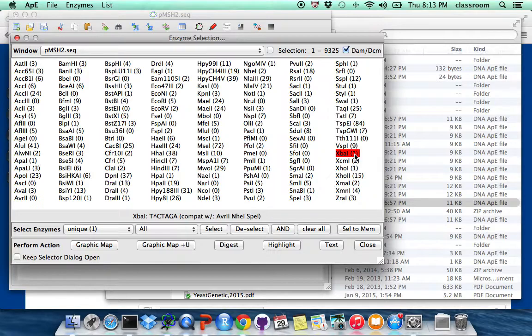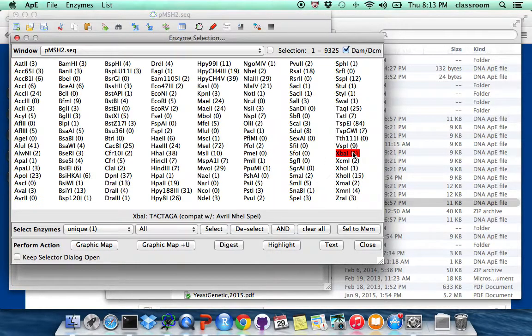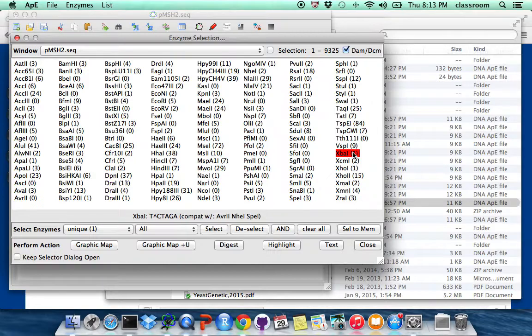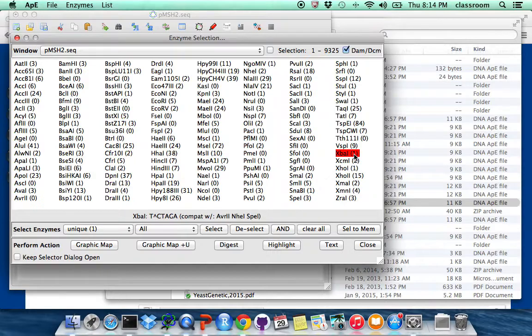When I highlight on the enzyme, you will see at the bottom, at the screen at the bottom you show this is the TCTAGA. So this is a 6 base pair cutter. And this has one recognition site in PMSH2.